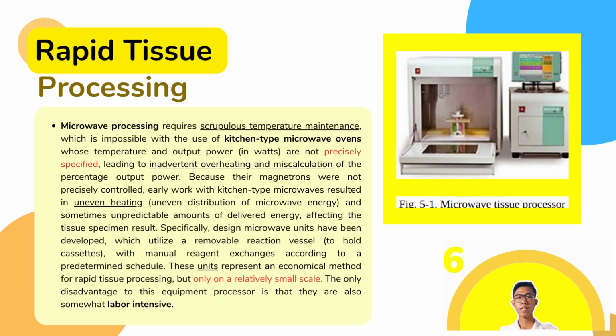These units represent an economical method for rapid tissue processing, but only on a relatively small scale. The only disadvantage to this equipment processor is that they are also somewhat labor intensive.